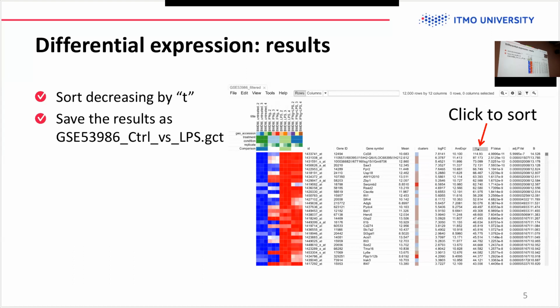So limma, as I was trying to tell you yesterday, linear models really like to work with data that has normal distribution, so that normal noise and so on. And this works only for gene expression data in log scale, not linear scale. So basically we did the log scale, and now for log fold change, limma doesn't change anything. In our case, because the data is already log scaled, it's just the average difference in these numbers in LPS samples compared to untreated samples. And actually, let's look at the actual numbers.